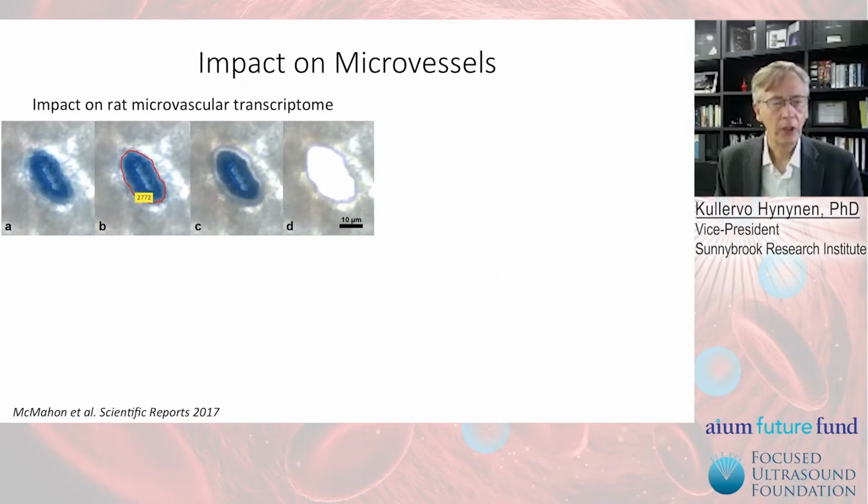We also looked into the impact of the sonications and microbubbles on the microvasculature. And Dylan McMahon took brain samples, outlined the endothelial microvessels, and analyzed them.